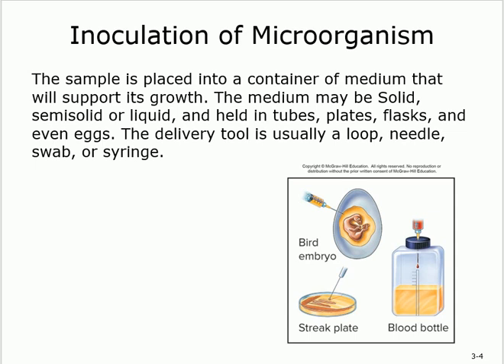The medium, and we will study it in detail, can be solid or liquid or semi-solid. Solid and liquid are the most common ones. Semi-solid is not that common. Where are you going to put it? You can put it in a tube, a plate, a flask, eggs, anything. Most likely it's plates, but we will see.